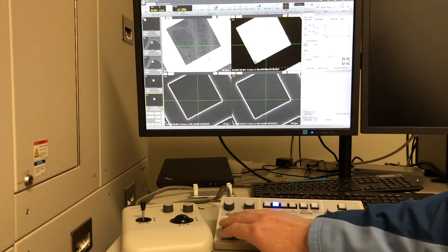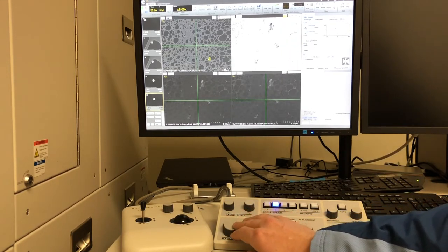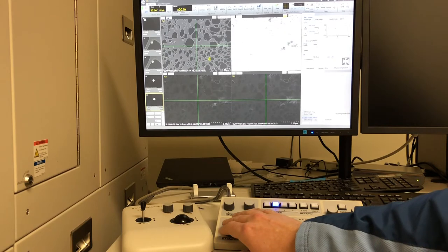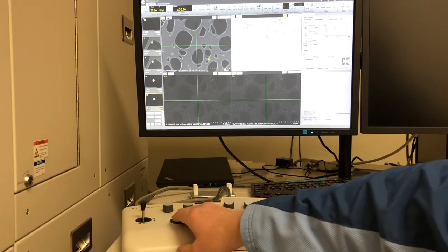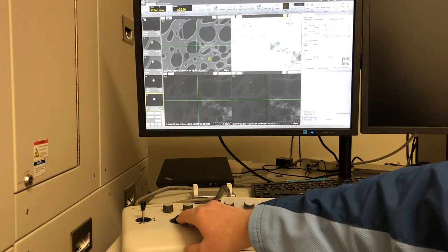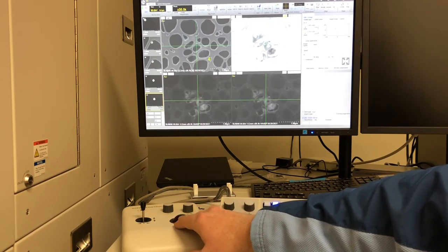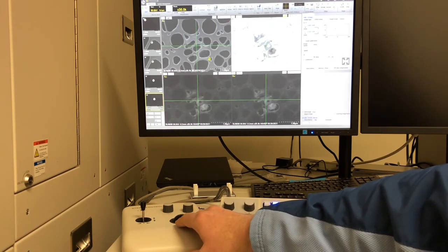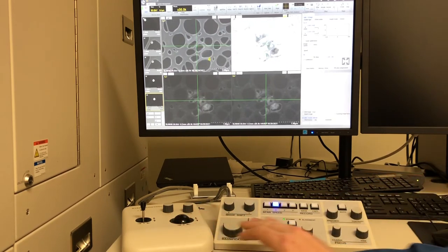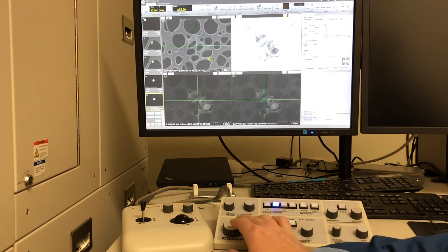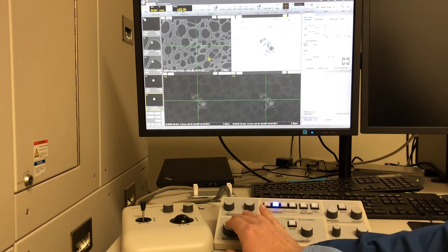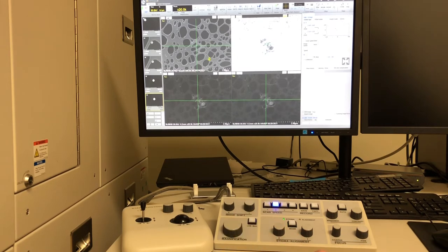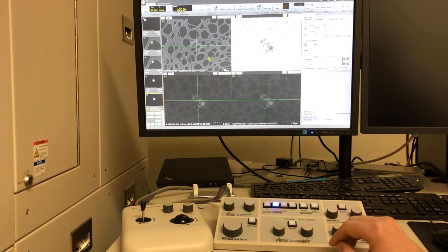So let's zoom in with the magnification. Now I can see an agglomeration of them. And I'm going to zoom out to 20,000X magnification.